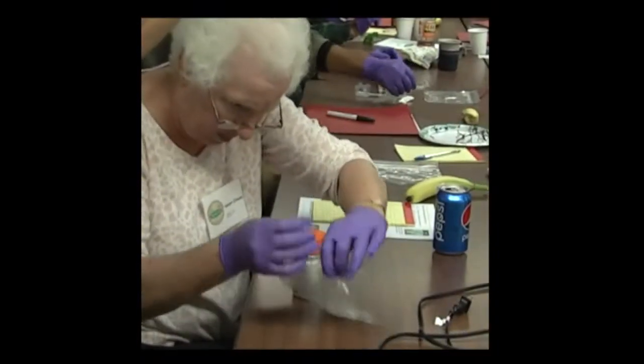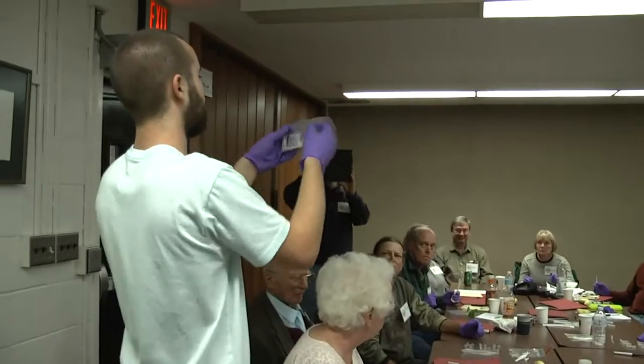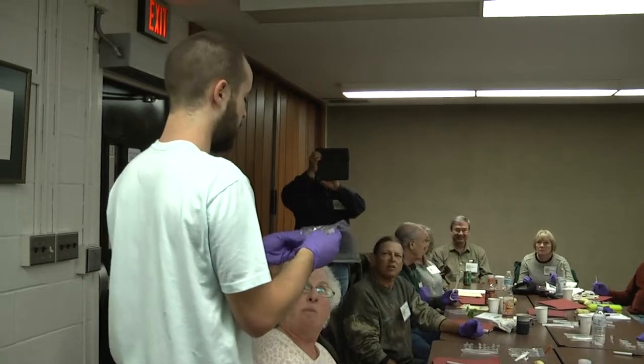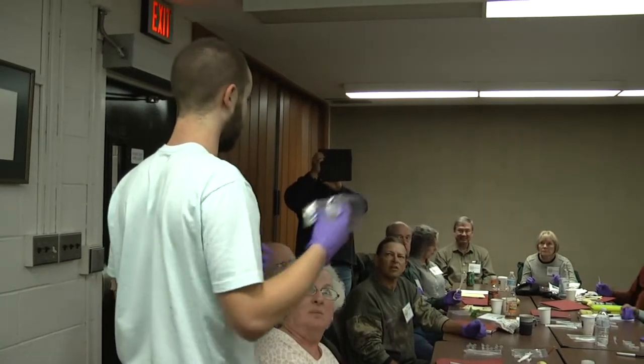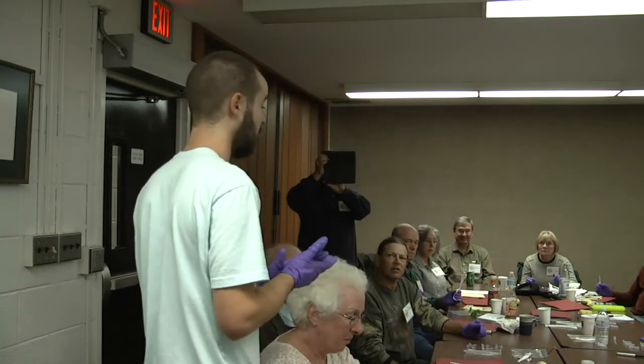It's not the best thing to have on skin contact. When you're done, you have a bag like this. You just want to shake them up and make sure that they're all in the solution. And then just put them in your bag or wherever you want to store them that's out of light, and then we'll check them at dinner, and then we'll see our result.